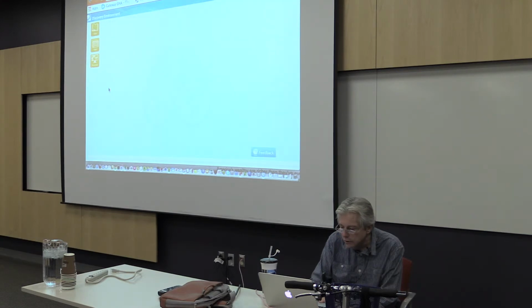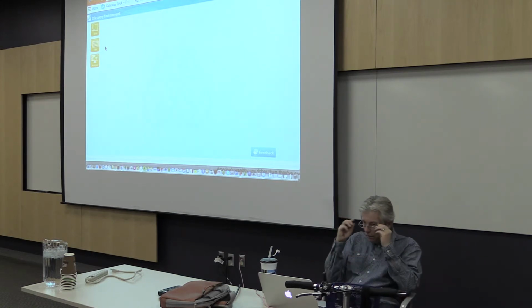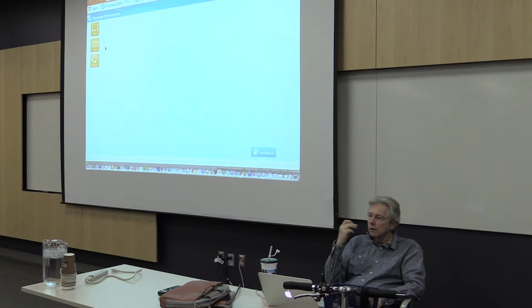I don't know if I'll have time to go through and show you clicking all these things, but I can do it quickly. The main thing for you to understand is that you can go through this on your own, and I recommend doing so, because we don't really have time, as I said before, to do it and wait for the results, and then have you look at your results. Ideally, you should do it and see it work and get used to handling the discovery environment. This is a great way of doing it.